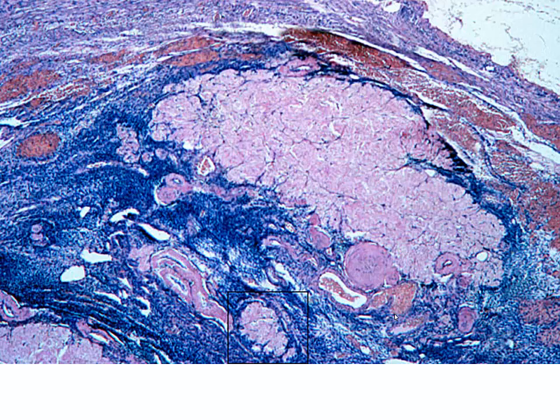Now, as we look in the medullary portion of our ovary, we're going to be looking at a number of different types of structures. Here we have a corpus albicans. This is going to be more of the connective tissue portion, the portion that is lost from the scarring that occurs after the corpus luteum degenerates. We also have a smaller one that we can see here, but this is a corpus albicans.